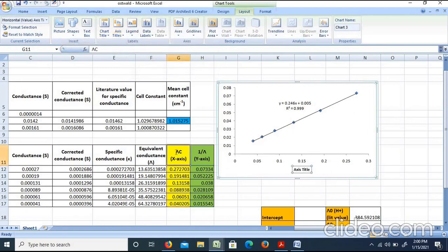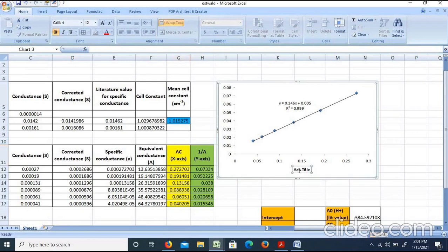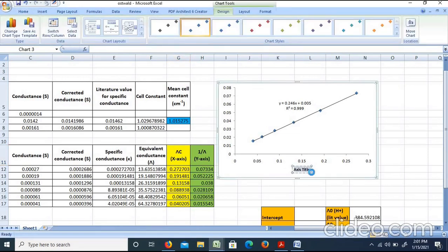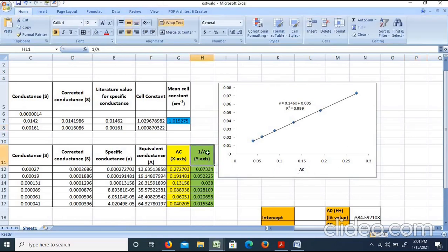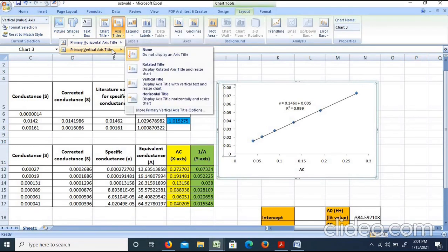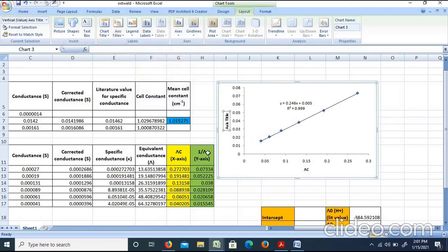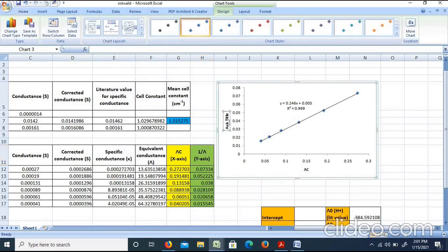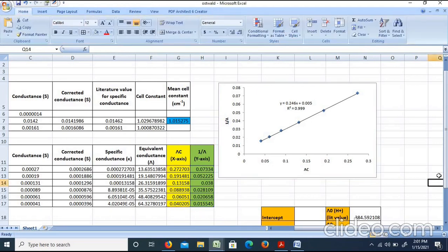We select lambda·C as the horizontal axis title. For the y-axis, go to Layout, then Axis Titles, then Primary, then Rotated Title, and enter 1/lambda as the axis title.